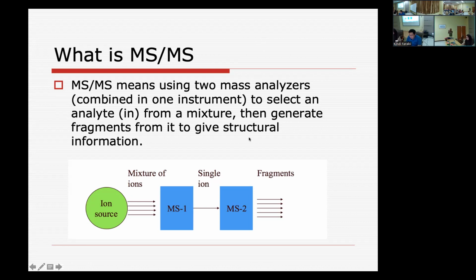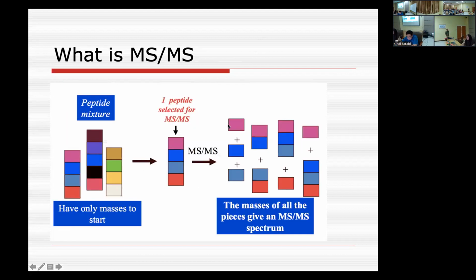Jadi tidak cukup dengan satu MS. Kita tambah lagi MS, jadi fragmentasi lagi. Itu akan diketahui dengan menggunakan MS. Berikutnya, ini juga sama. Contoh tadi adalah peptida yang hanya mempunyai satu massa. Kemudian satu peptida atau MS pecah lagi.